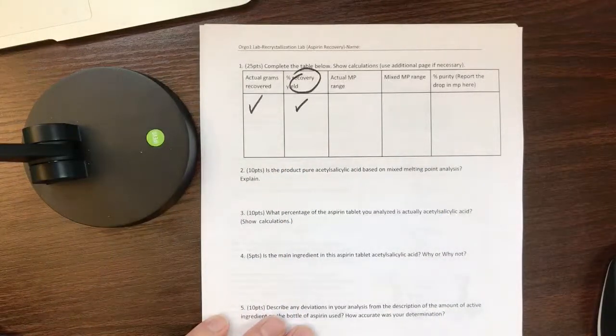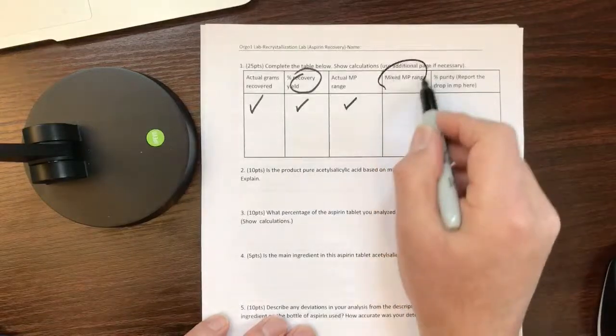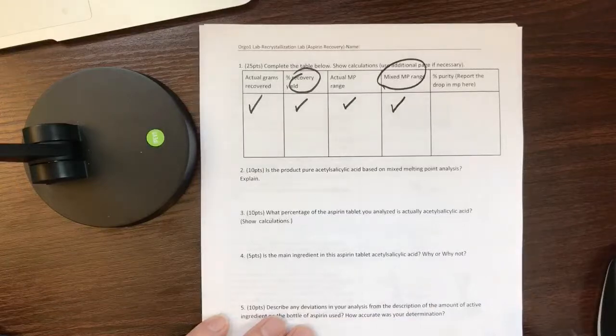Melting point is always a range, so we report what the range is. Then, like we did in lab 1, we're going to mix real aspirin and your product, what we call a mixed range. So make sure what you have recovered is not the filler or starch, but really the aspirin.